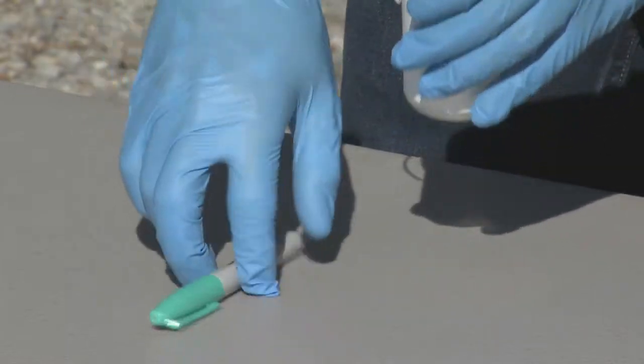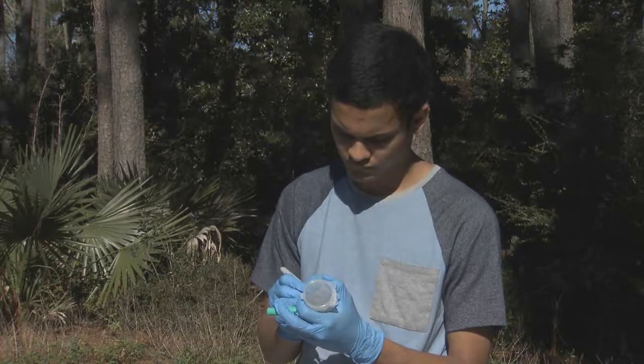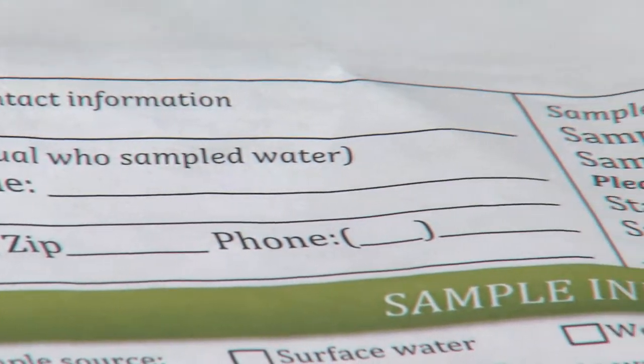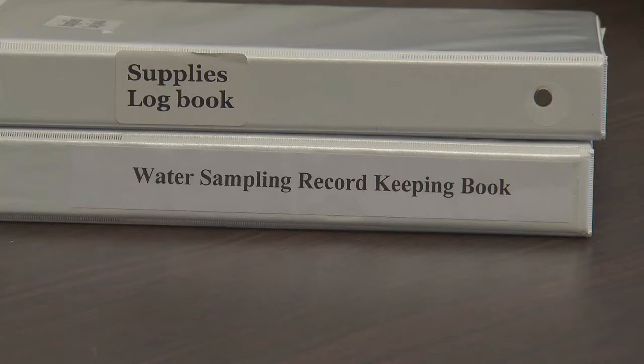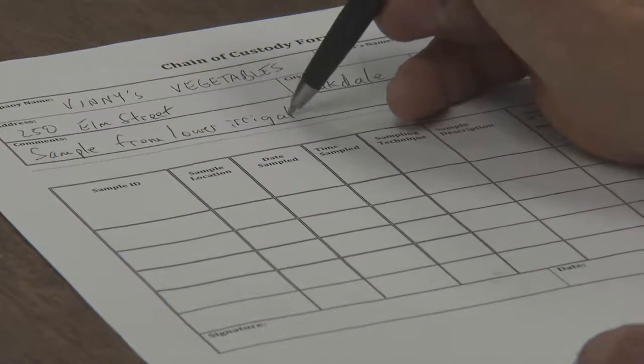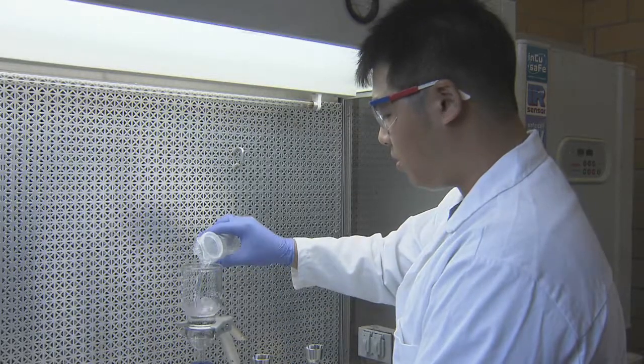This information should be written on a waterproof label, which should be securely affixed on the sample container. The same information must also be recorded on the water sampling recording sheet. Keep records of all collected samples and a key for sample identification. Complete a chain of custody record form, which will help to keep track of the sample and any mishandling of the sample.